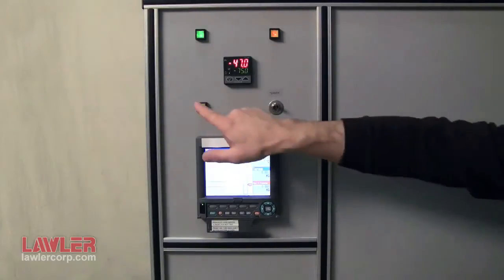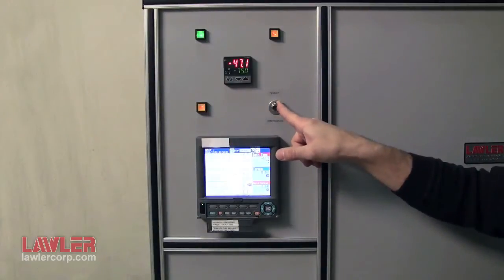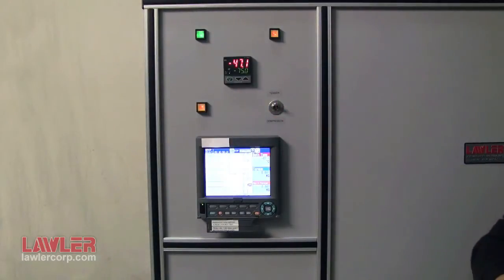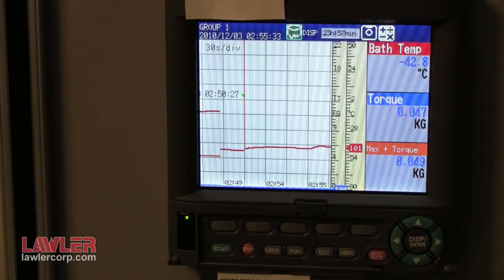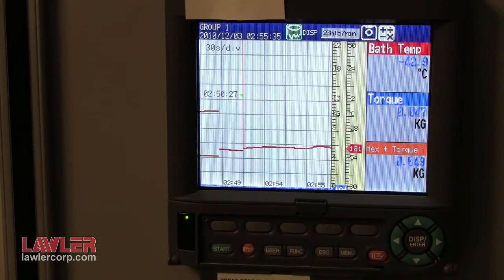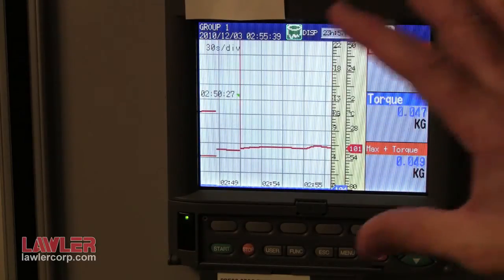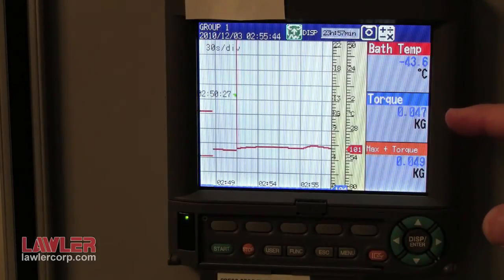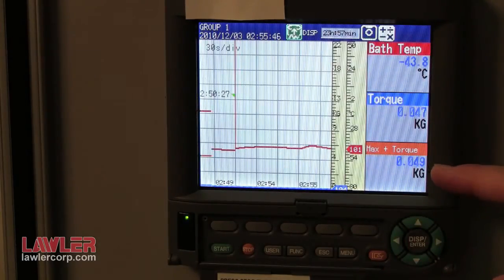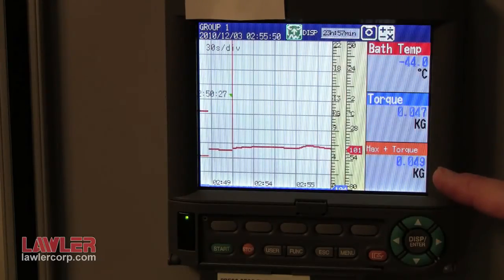Then press the motor start button. Make sure that the selector switch is in tension for D1478. With the motor running for one additional hour soak period, record the values. The recorder captures an XY plot, as well as digital values of temperature, torque, and maximum torque, which is required in the method as the starting maximum torque.